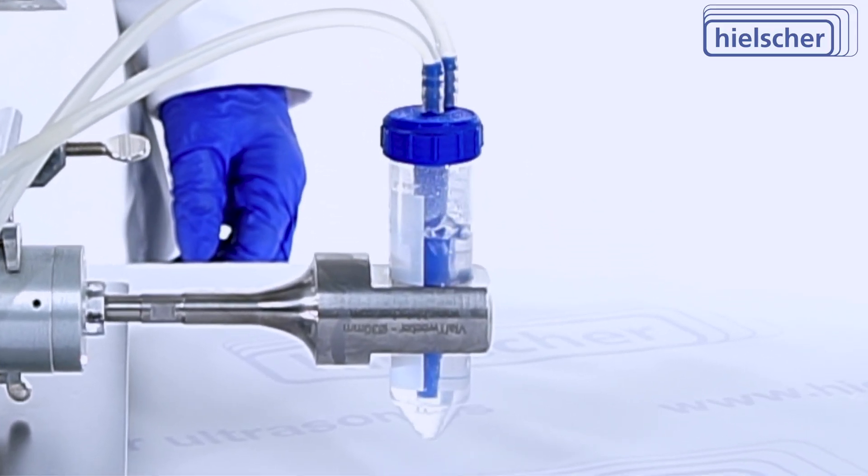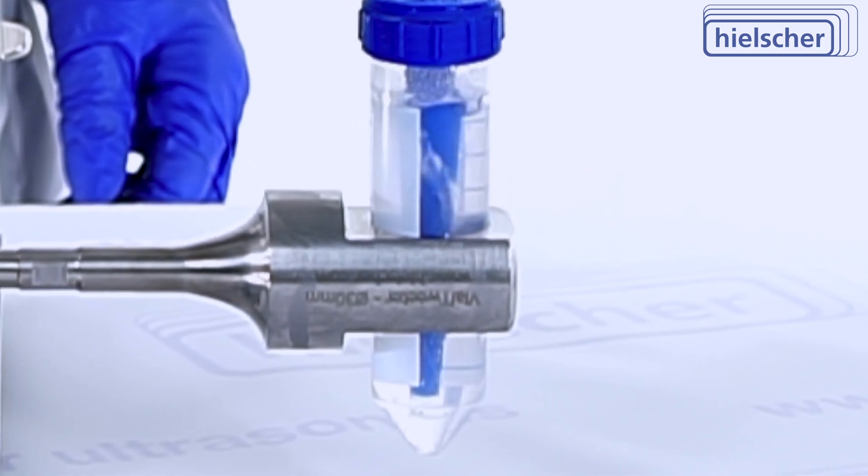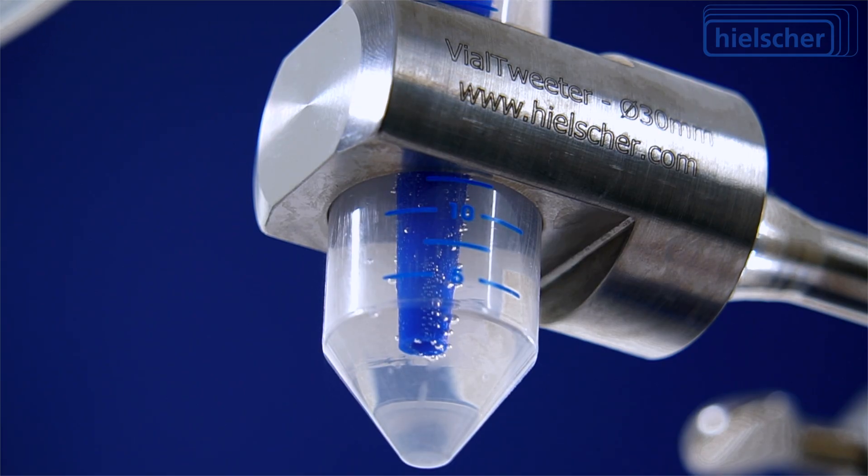Perfect for flow chemistry, enzymatic reactions, or pilot-scale product optimization. By exposing each portion of the fluid to uniform, high-intensity ultrasound, this setup ensures reproducible results and faster reaction kinetics.